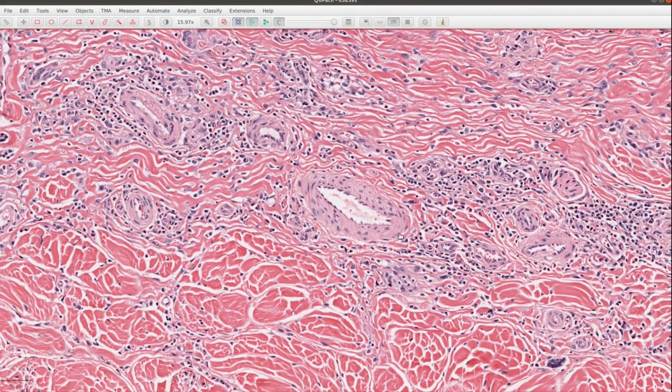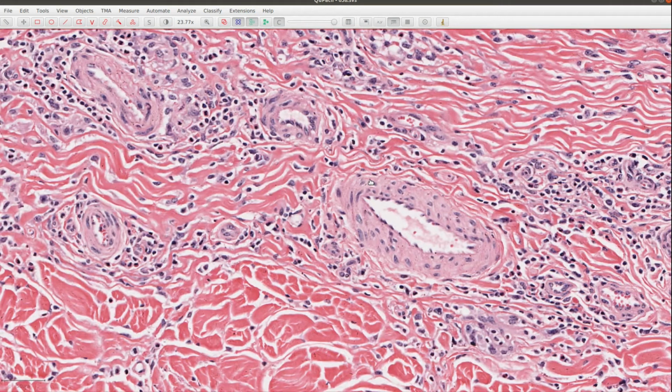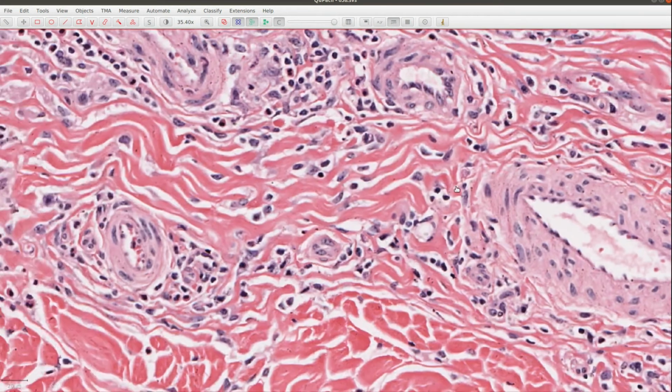So we've got some lovely arterioles here. There's a nice one here with its endothelium again, forming the tunica intima, tunica media with its smooth muscle, and then this is stained with H&E. So unfortunately, we don't have the lovely turquoise colour for collagen. It's just this kind of reddish pink. But we can appreciate the tunica adventitia merging with the surrounding connective tissue as well.